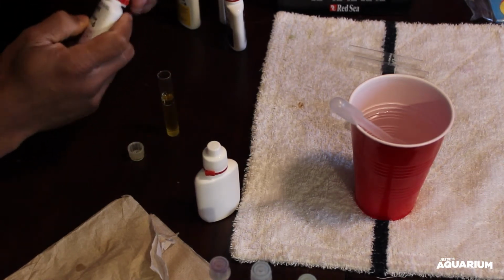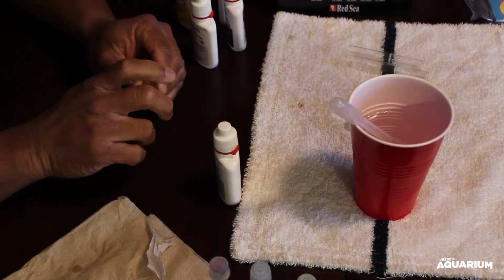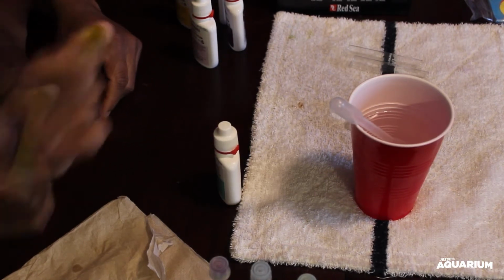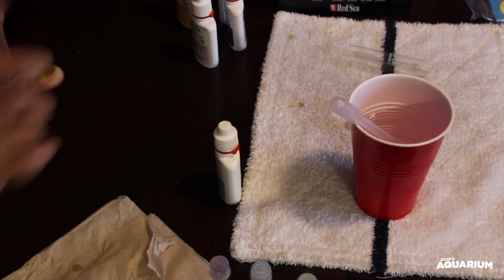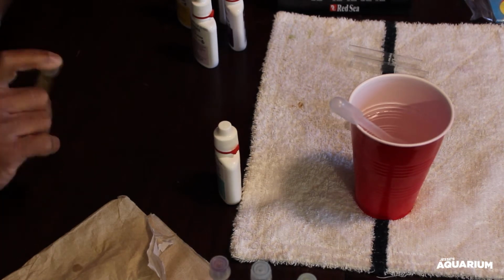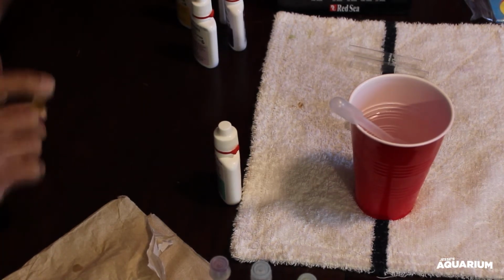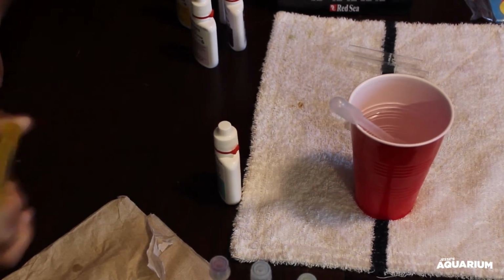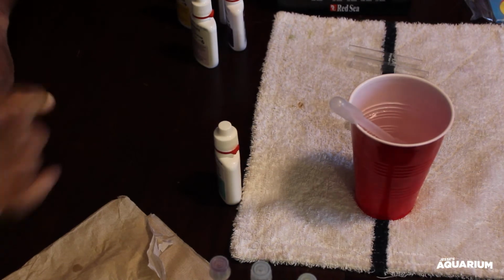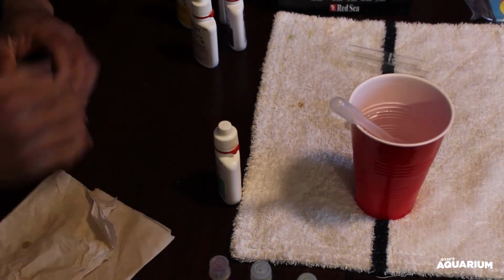Alright, now after you add this second bottle of titration of nitrate, that's when you have to give this vial a shake for at least 1 minute and then let it sit, and it'll give us our reading. So here we go, 1 minute. This is one of the ones I hate doing the most, because I have to sit here and shake my arm vigorously for a minute just to make sure we get this titration solution blended together. But it's all well worth it in the end, because you want to make sure your nitrates are not very high in the tank, depending on what type of tank you have as well. If you have a tank that's basically dominant SPS, you definitely want those nutrients a whole lot lower. I think I went a little over a minute, but it is what it is. And we'll let that sit.